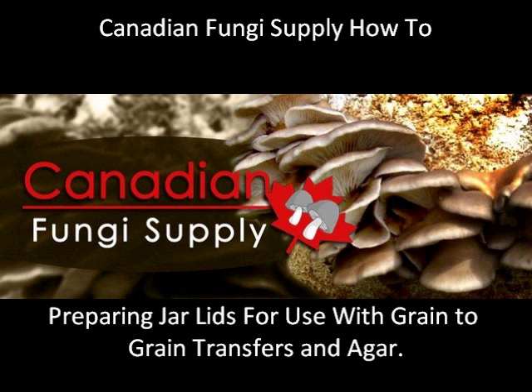Welcome to this episode of Canadian Fungi Supply How To. In this video we will be going over one style of lid design. This lid design is best used for people who do a lot of grain to grain transfers and who inoculate their grain spawn with auger.